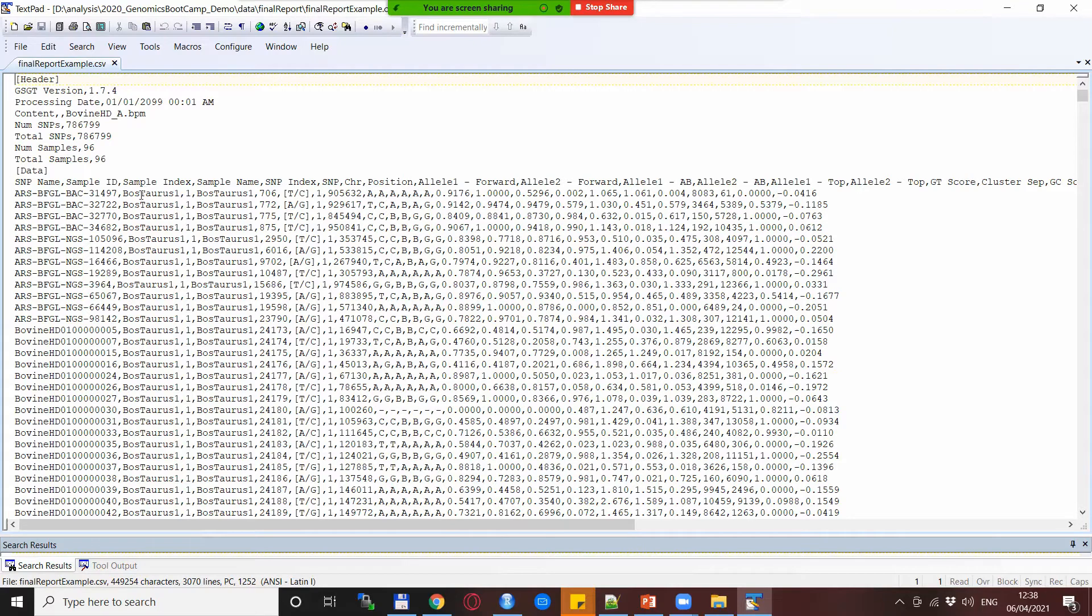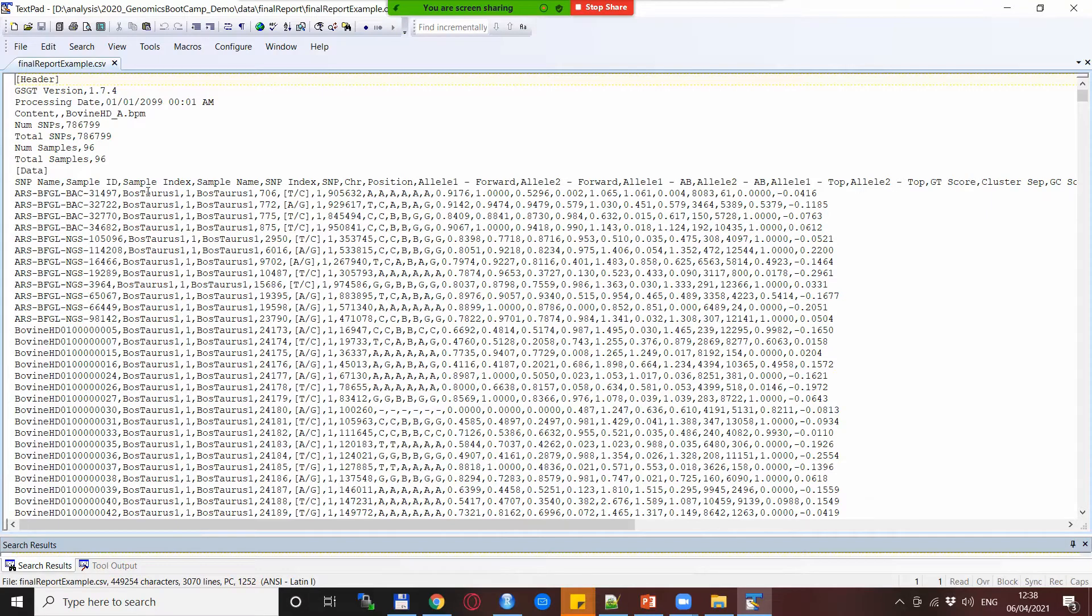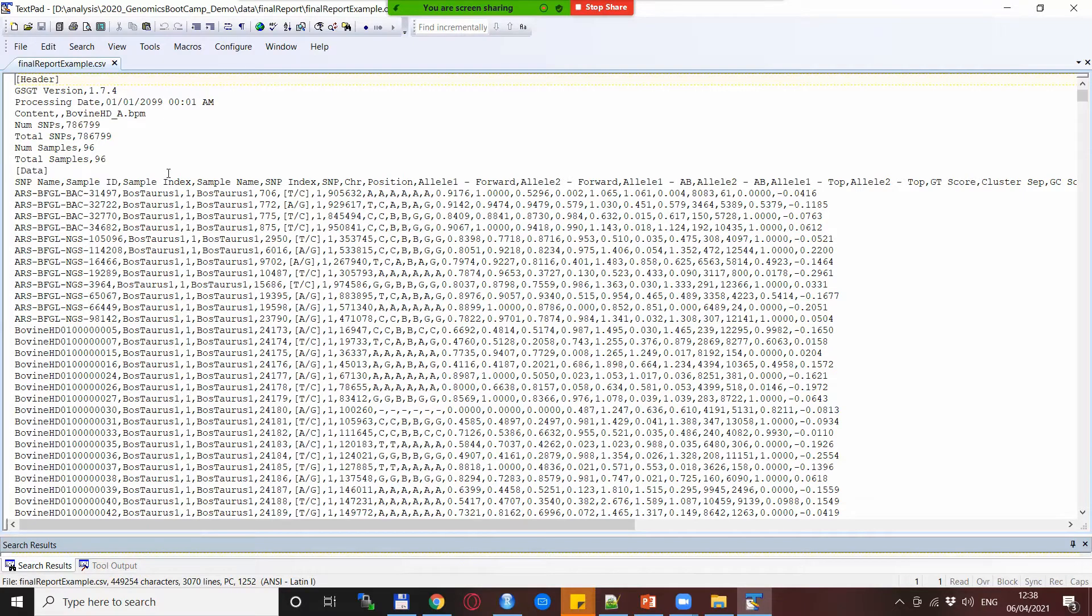I changed it from the actual IDs to Bostauros 1 to Bostauros 10 because there are 10 animals and these are real data from CATL-HD SNP chip.